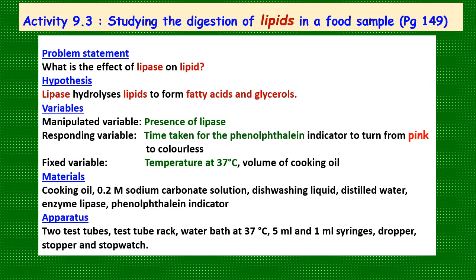Lastly, studying the digestion of lipids in a food sample. Activity 9.3, page 149 of the Form 4 textbook. Problem statement: what is the effect of lipase, the enzyme lipase, on the substrate lipid?